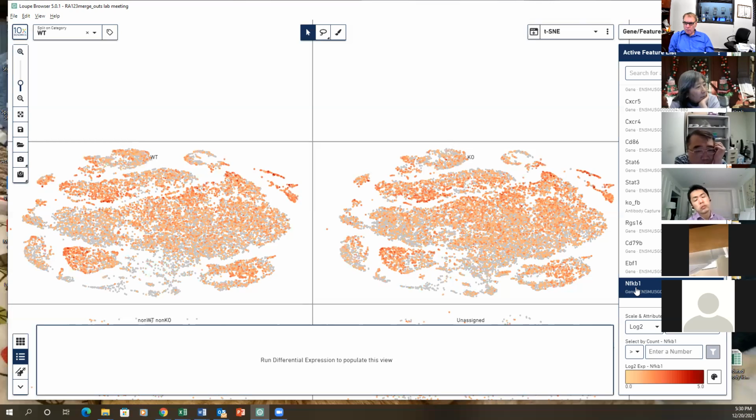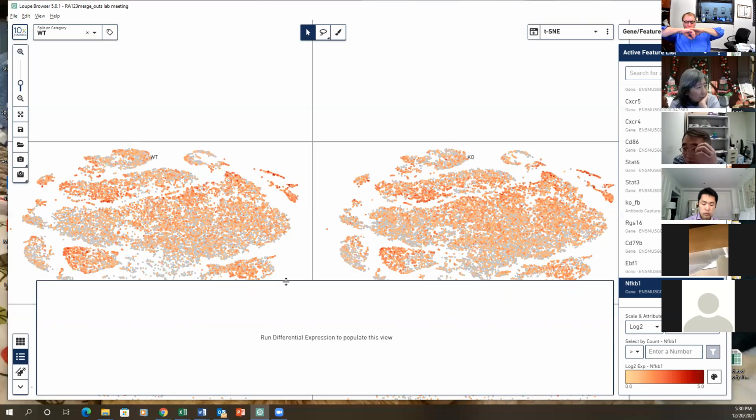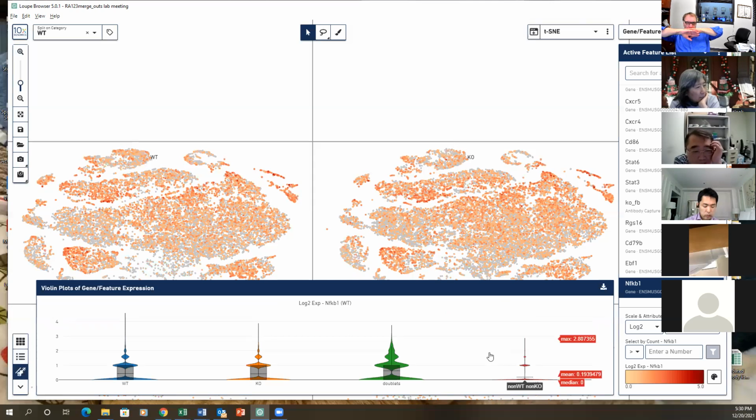I was thinking to do the genotyping to double confirm this. I checked the genotype result we did, that's back to Kevin, and based on the result the genotype is no doubt. But when we did the experiment, we left some blood just in case, so I'm thinking of double confirming the genotyping again.